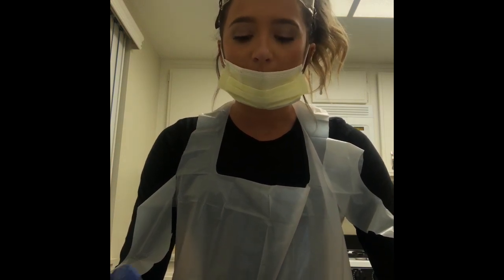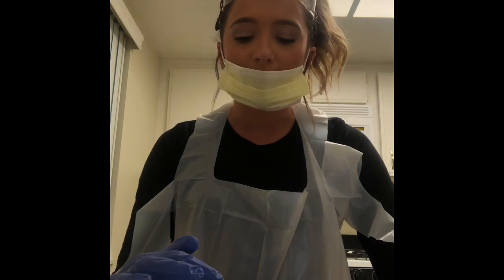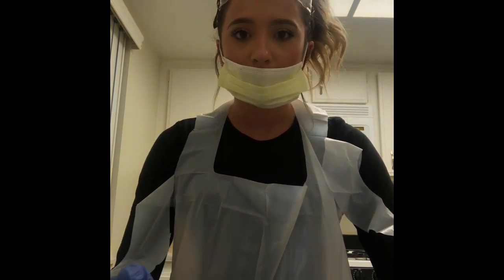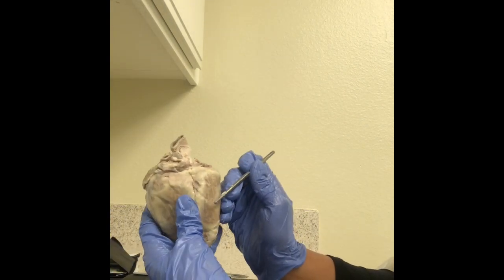So in this video, I'm going to be dissecting a sheep's heart, and then I'm going to be identifying different parts of the sheep's heart. Okay, so I'm going to start off by labeling the external posterior parts of the sheep's heart. I'm going to be starting off with the right ventricle.